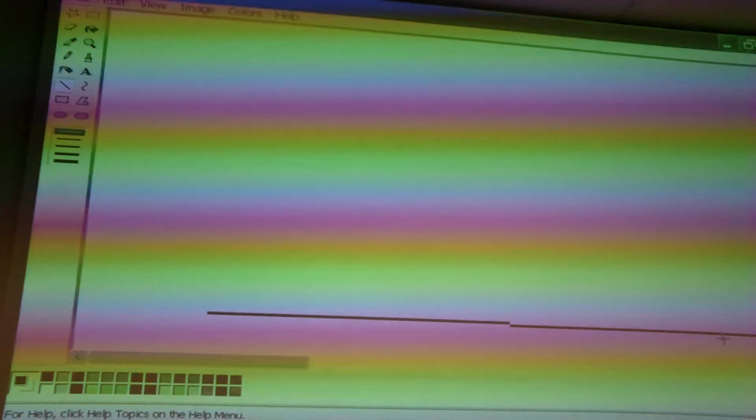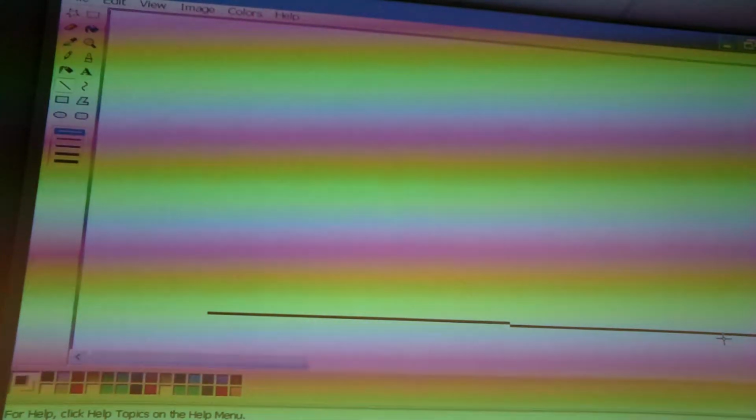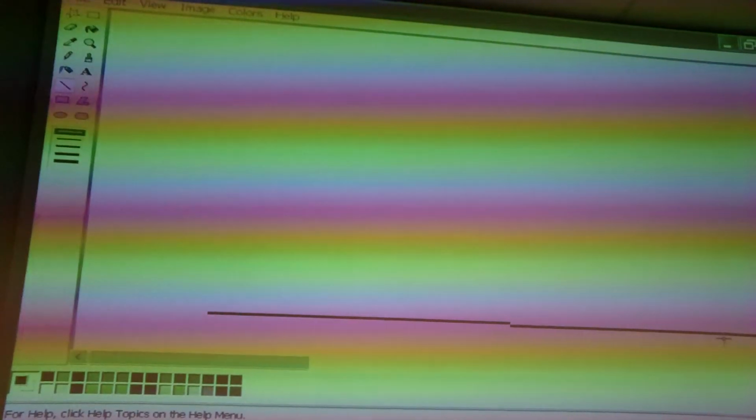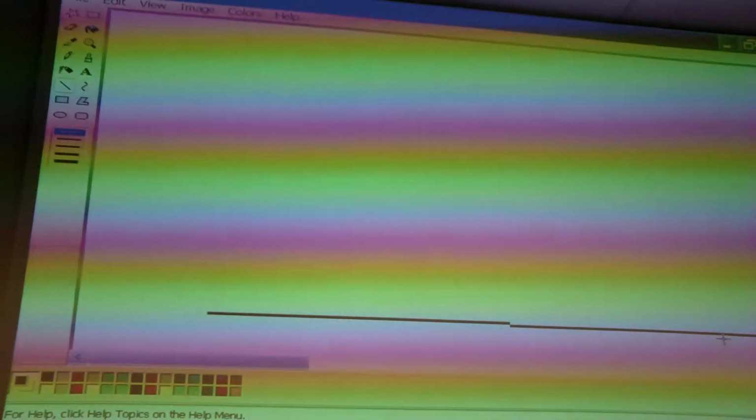It depends on the buffer itself. Culture medium, if you buy it, does it have any albumin? No. But we typically add 10% fetal calf serum. So 10% blood, basically. And compared to a few cells in the culture, what do you think? Do they produce a huge amount of protein if they're in cell culture for a couple of days?